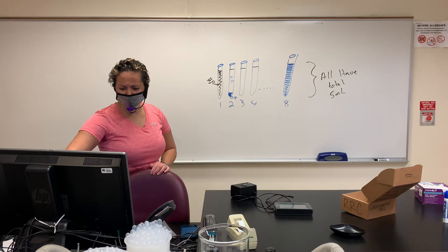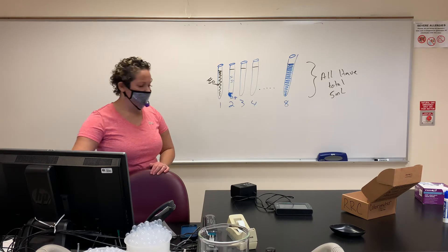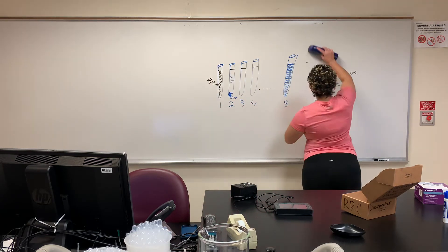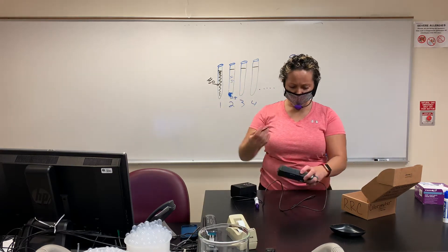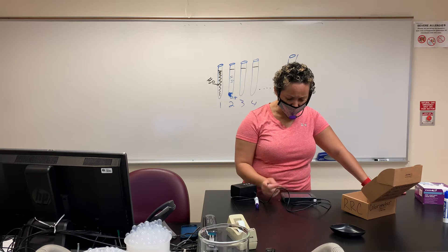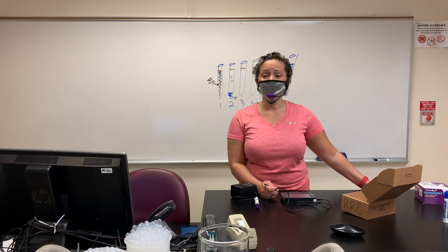So we just need to set up our colorimeter. You're going to use your little stylus, click on the top where it says file, and then hit new. If nothing happens, that's great — it means somebody cleared the last information. I always do that before I get started.